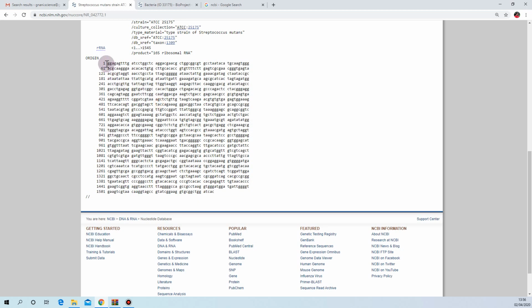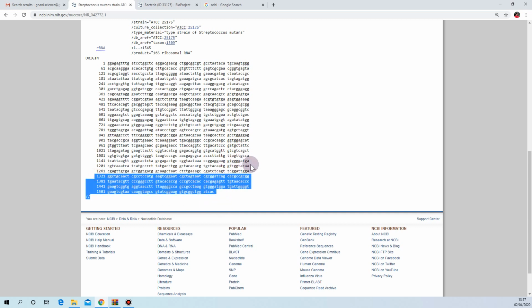So it starts from the first nucleotide to the last nucleotide, and remember that this is very important, like it says the identifiers, that's the identifier for us. So this should be observed every time when you are downloading the sequence. If it is a short sequence, it's well and good. If your genome is very big, and sometimes just because of net loading problems, the sequence may end up here, like in this portion it can end up.